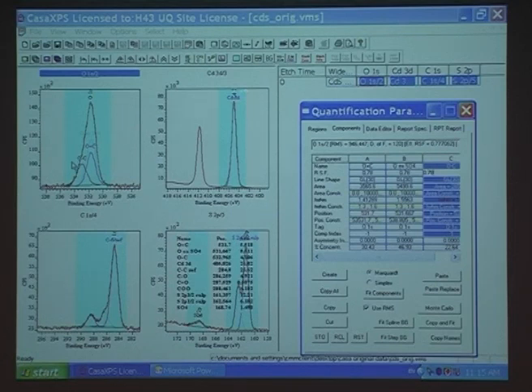Okay, and the oxygen is included in here somewhere. If I went into this NIST table, I'd probably find that cadmium oxygen comes in somewhere close to one of these, because I've just got too much cadmium. The sulfur's very neat. Here's the cadmium, 20, nearly 27. If we take the sulfide, we've got 18 point something. If we take the cadmium sulfate, there's only one and a half, so that makes 19, about 20. We've still got five extra cadmiums.